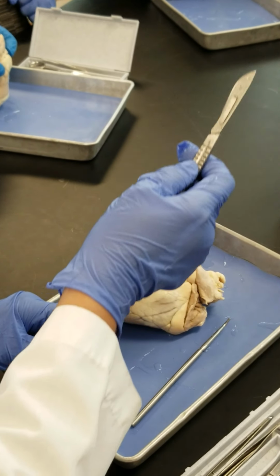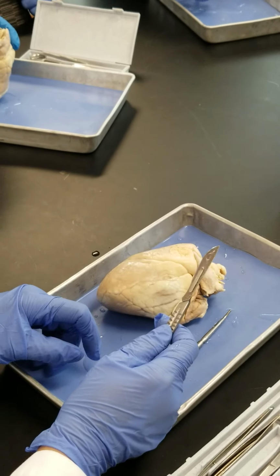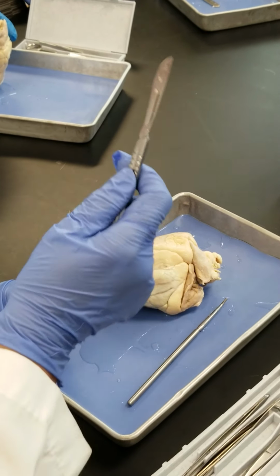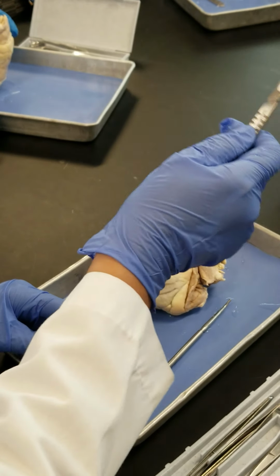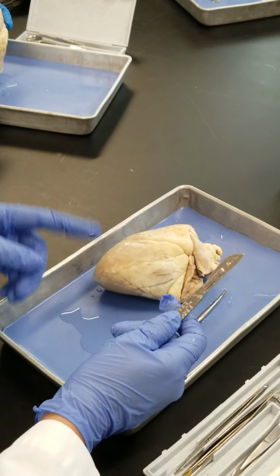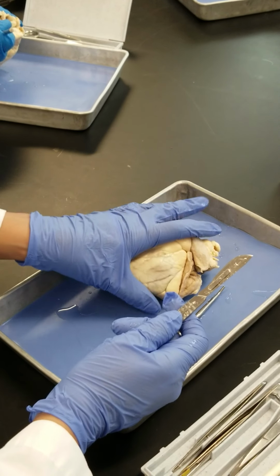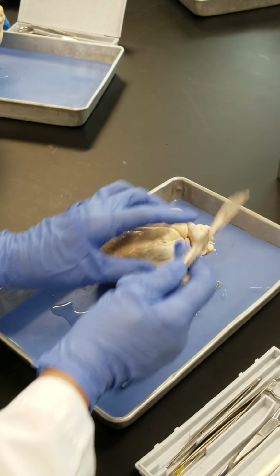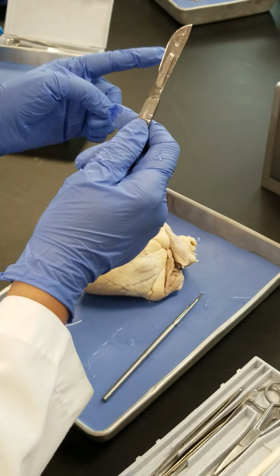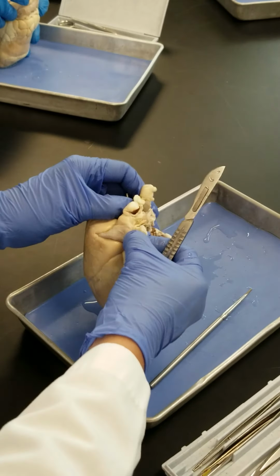So make sure that you are cautious about using these, and specifically the ones that you do not have in hand, right? You cannot know exactly what the other person that has this blade in hand is going to do, right? So whatever you are going to do, put your finger, point at something, or whatever you want to point at, just make sure that the other person that has this one in hand knows where the other finger of yours is going, right? So be very careful about those, right?